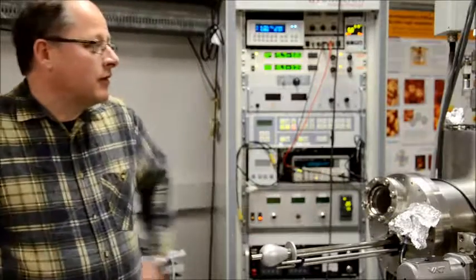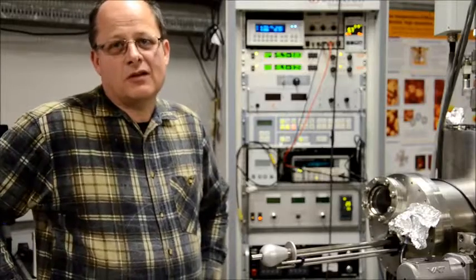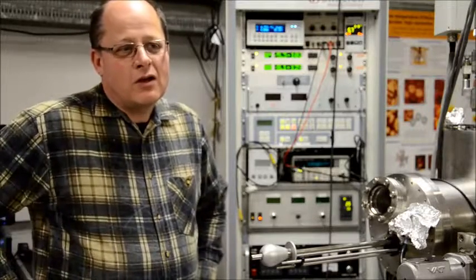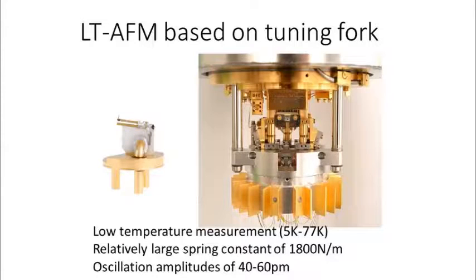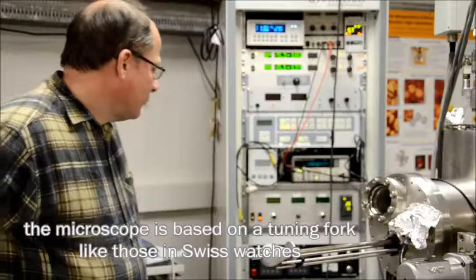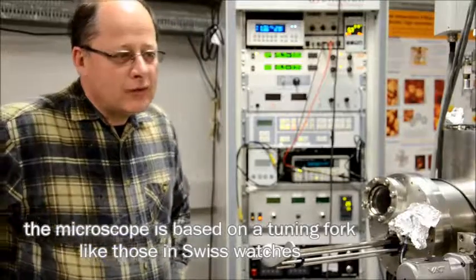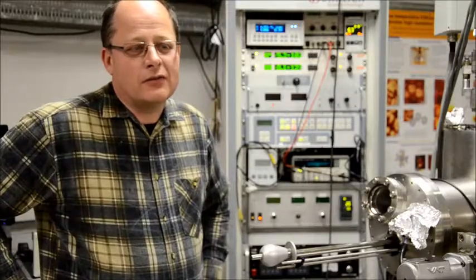Other than that, it's a microscope based on a tuning fork. It's a small tuning fork which you also use in Swiss watches, and that's the sensor basically. So it oscillates above the surface, and you detect with this electronics here the frequency shift, and out of that you get the forces.